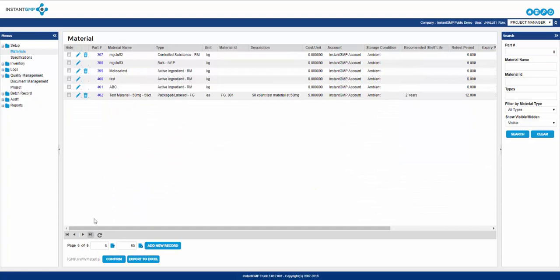Now a detail to keep in mind is deletion of materials which also applies to specifications. You can delete both up to a certain point within the software. After a material has been requisitioned along with a corresponding specification, neither of these can be deleted. The system begins tracking and logging all audible details at this point and therefore after requisition materials and specifications cannot be deleted. So be mindful and accurate when putting this information in.